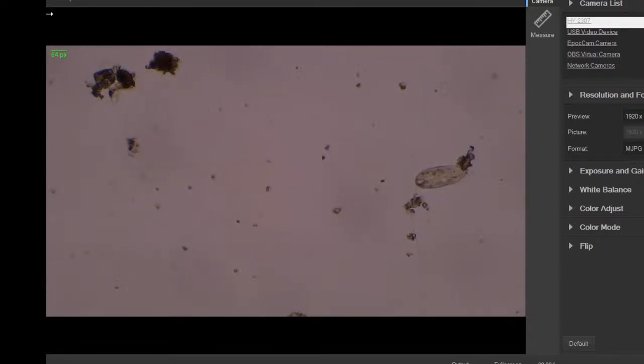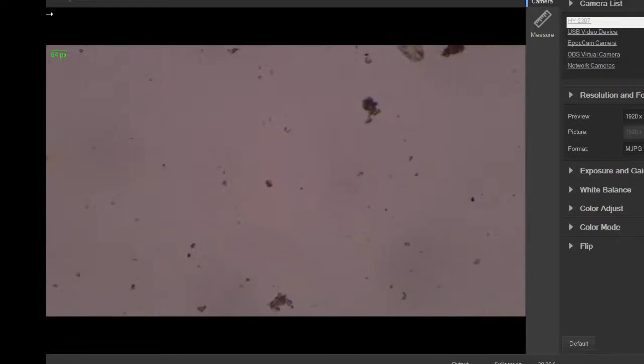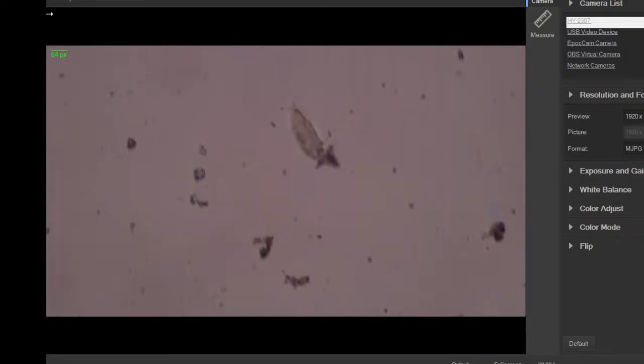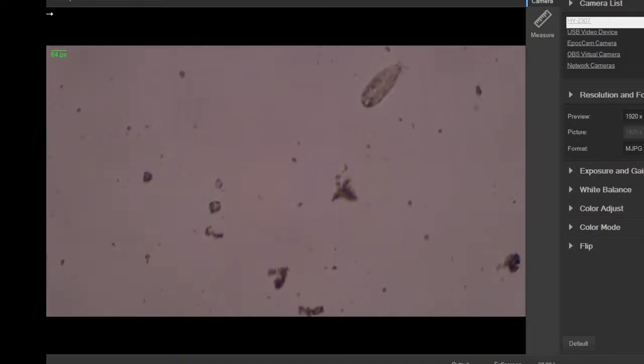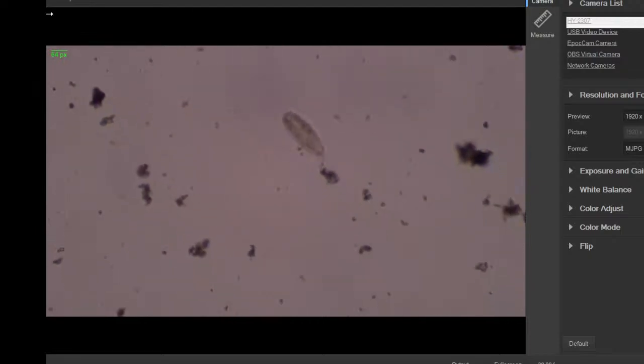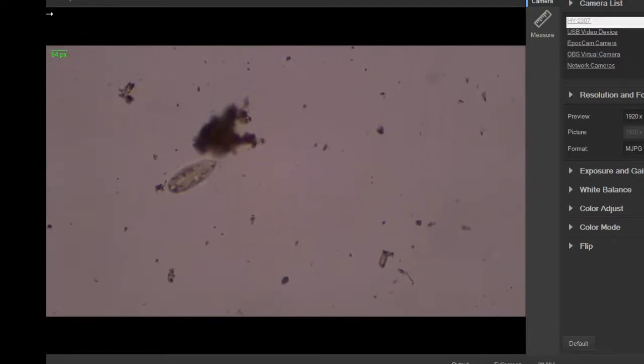But yeah, these guys are fun. I like these guys a lot. They don't move too fast. They have a lot of details. This one's moving kind of fast, but usually they're a little slower than this. I might take this whole slide and add that slime to it. Everything's too fast in general. Let me try. Whoa.